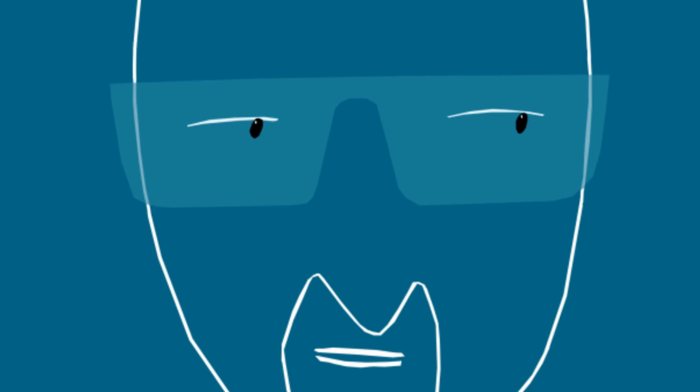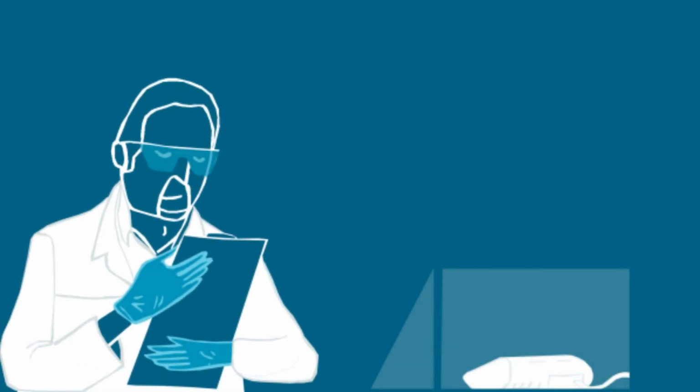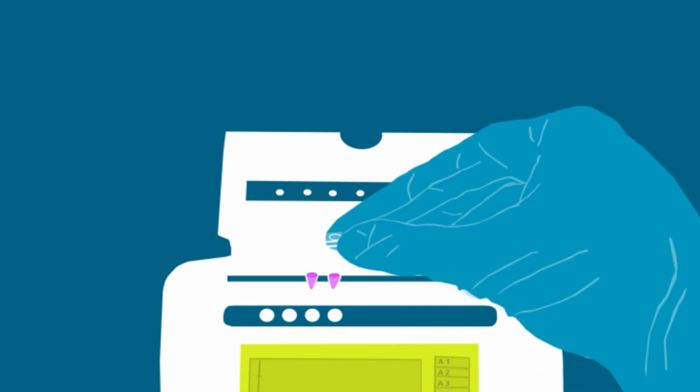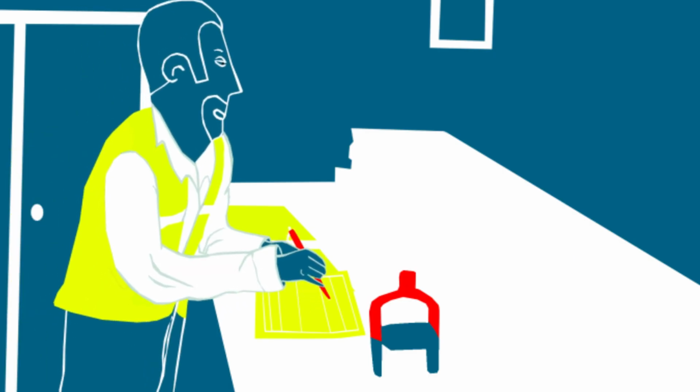Only when the LAMP test detects the specific DNA sequence of a regulated plant pest does DNA replication take place. The analyzer can measure this replication, thus making it clear that the sample contains a quarantine organism. If, however, no DNA replication occurs, we know that the sample contains a non-regulated fruit fly species. Within just an hour, it's clear whether the consignment can be released for sale.